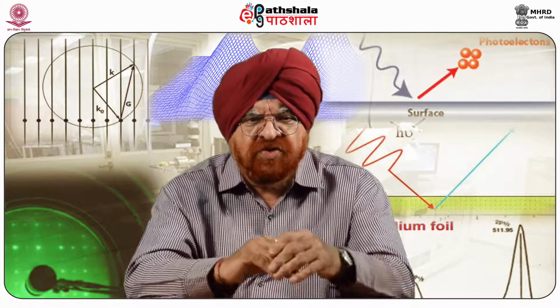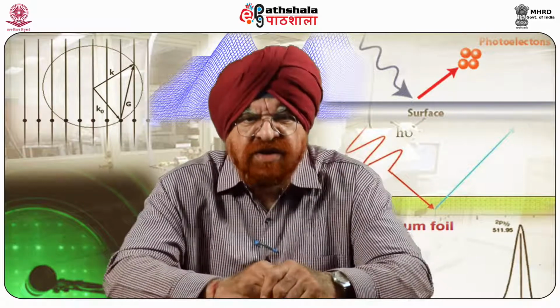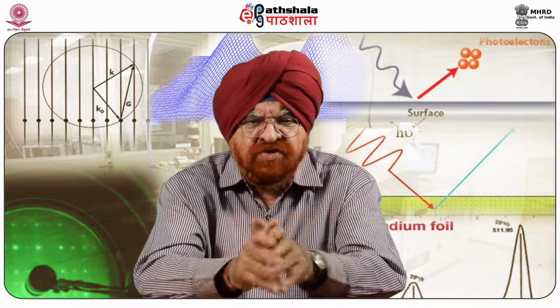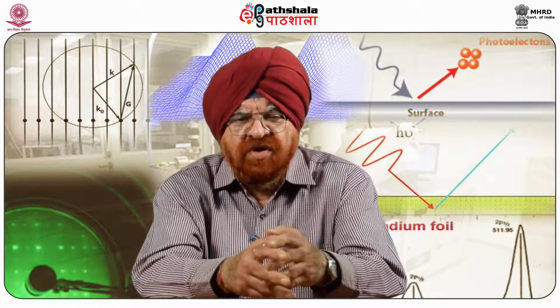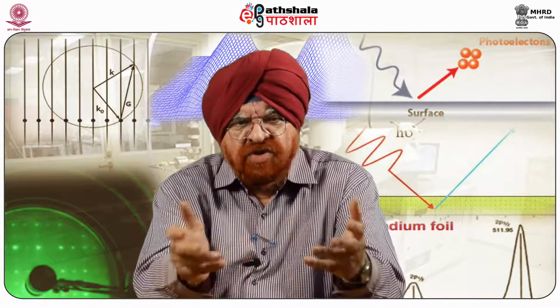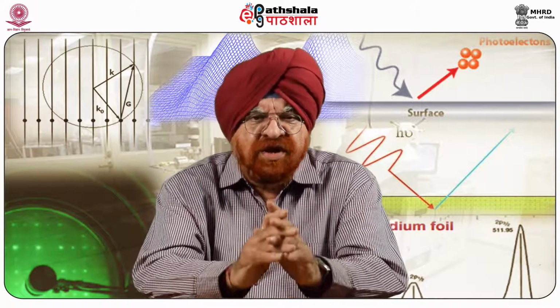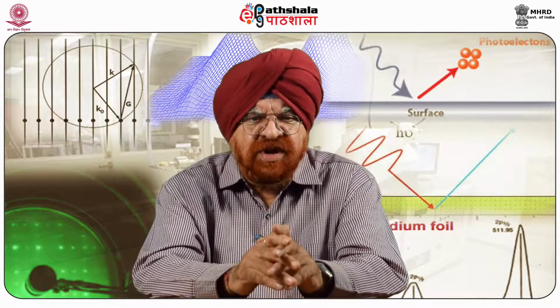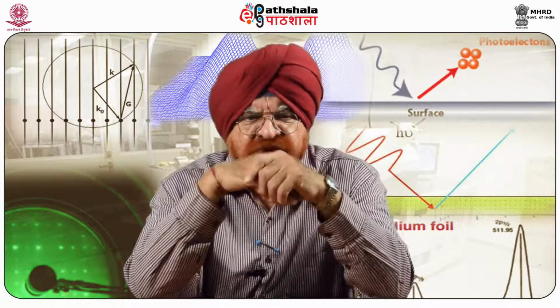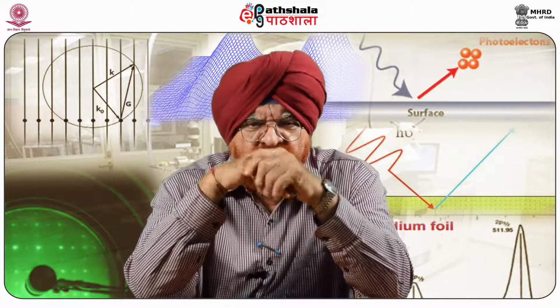In 2009 and 2010, and is in accordance with the literature, that is Bolduc et al. in 2005, Cho et al. in 2002, etc. When annealed at high temperatures, the XRD results indicate the presence of non-magnetic phases in the film containing cobalt.